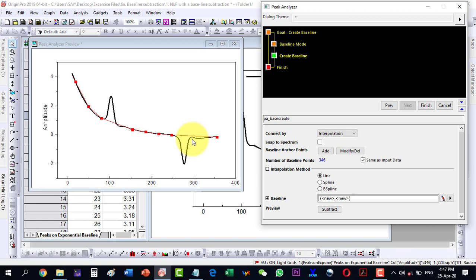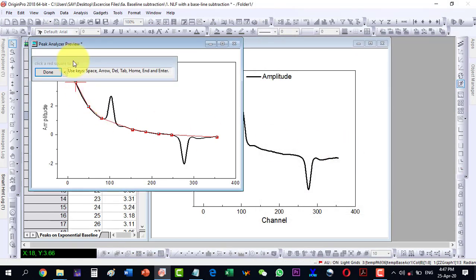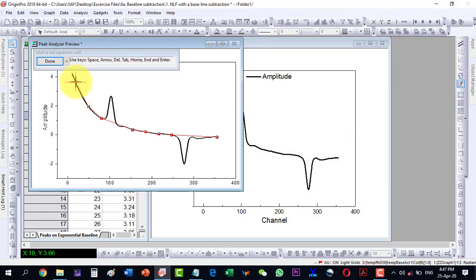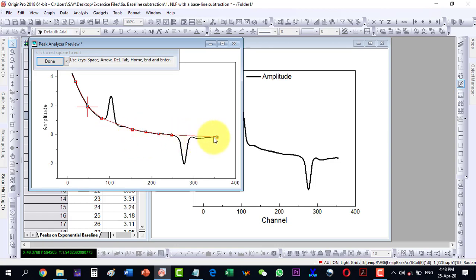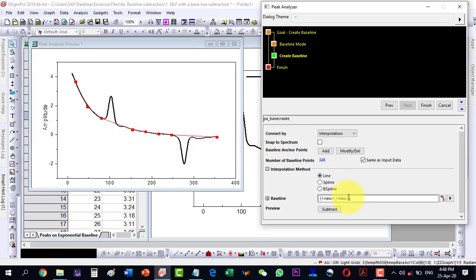These are the automatically found points. Click Next and it creates a baseline. If we are happy with this baseline we can proceed; otherwise we can click Modify. In the modification dialog, the first point looks fine. We adjust the next point slightly down and another slightly up so none are above the line. The rest look fine, so we click Done.